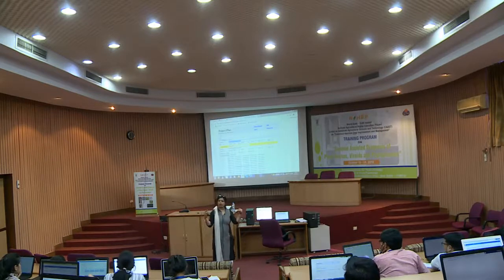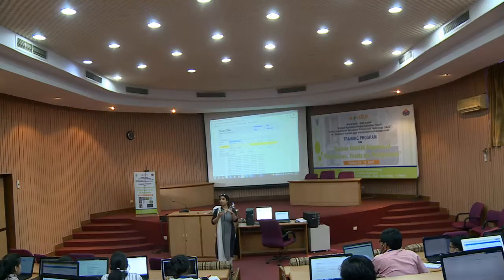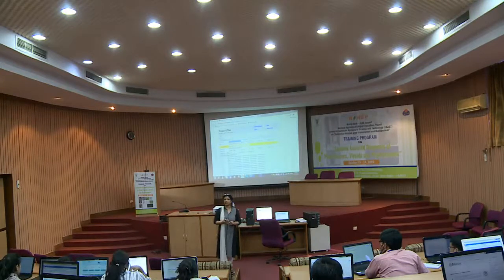PCR you can amplify up to 10 kb also, that is not a problem, but Sanger sequencing you have to go fragment wise, 500 to 600 bases per read. Per read here I mean that with a single primer, the sequencing company can generate only 500 to 700 good quality bases.